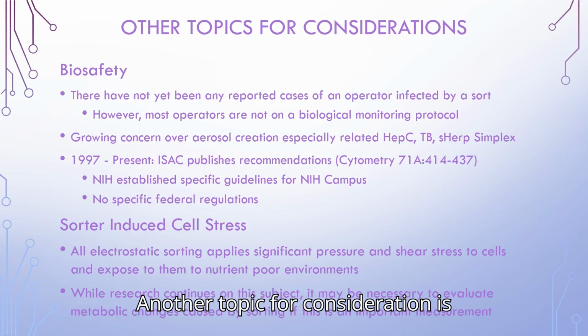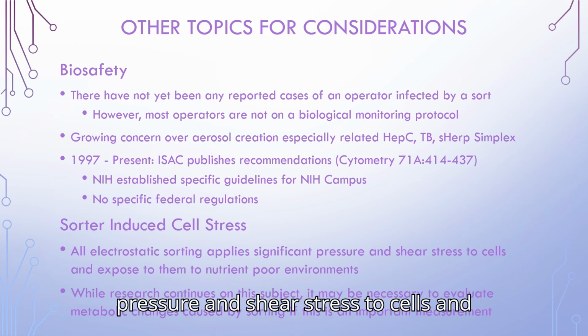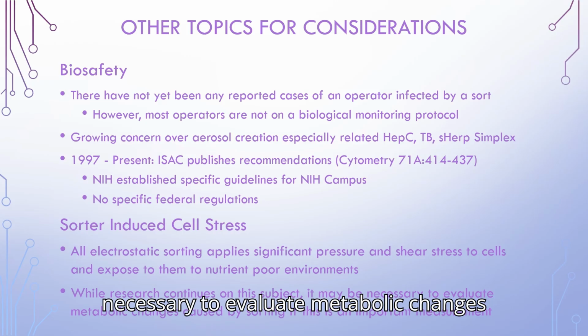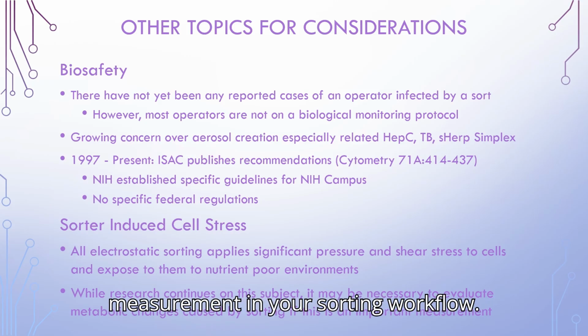Another topic for consideration is sorter-induced cell stress, often abbreviated as SICS. All electrostatic sorting applies significant pressure and shear stress to cells and exposes them to nutrient-poor environments. While the research continues on this subject, it may be necessary to evaluate metabolic changes caused by sorting if this is an important measurement in your sorting workflow.